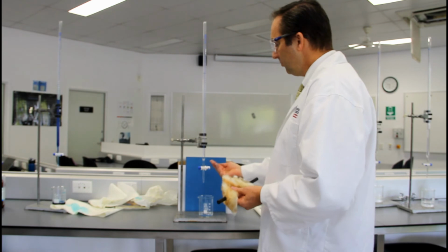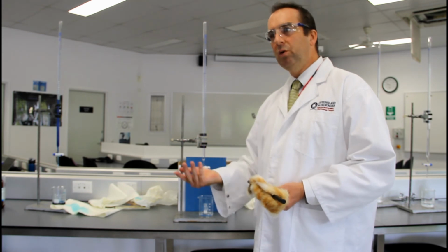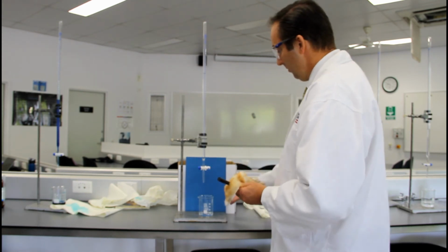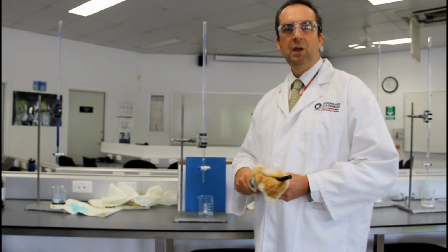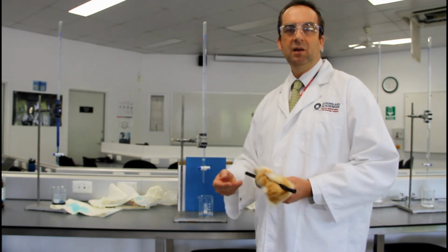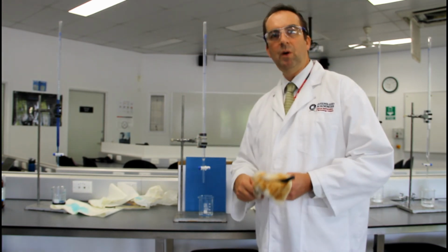And so when we looked at the streams and the movement of the streams, the acetone stream moved a little bit, but both the water and the ethanol streams were significantly bent when the rod was brought close to them. In fact, they made a real mess on the table here as the liquid sprayed over to the side. So that's an application of molecular polarity and just showing that we can determine the molecular polarity by looking at the bond polarity and the shape of the molecule. And this proves that those molecules do have that polarity.